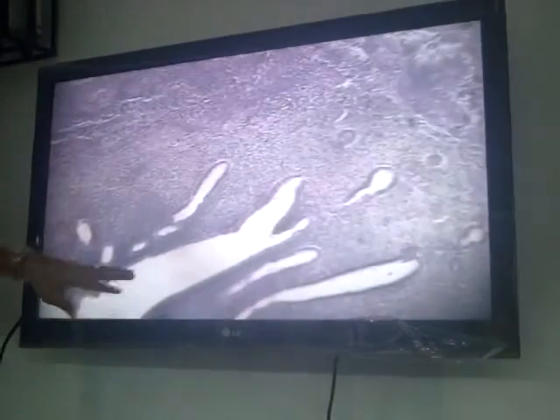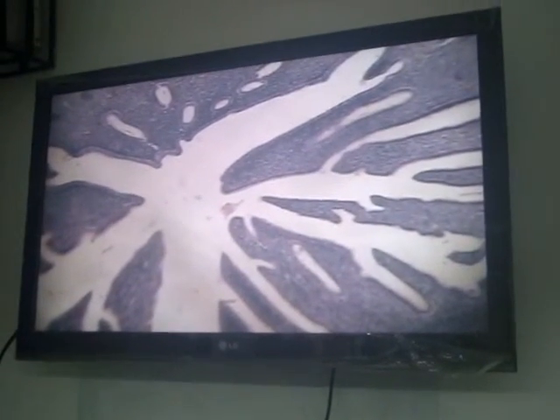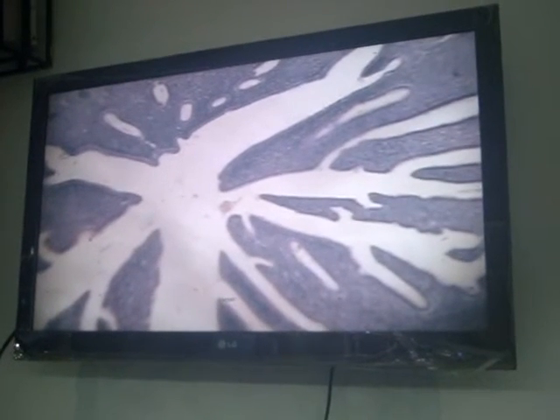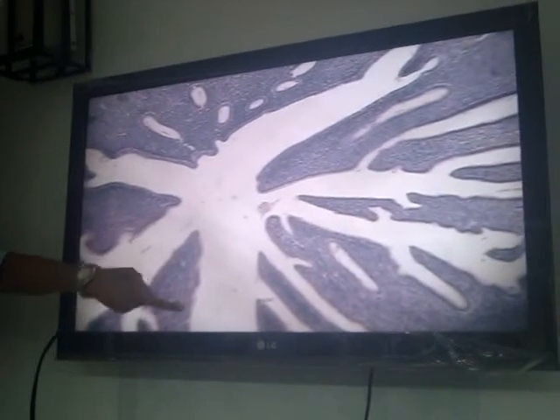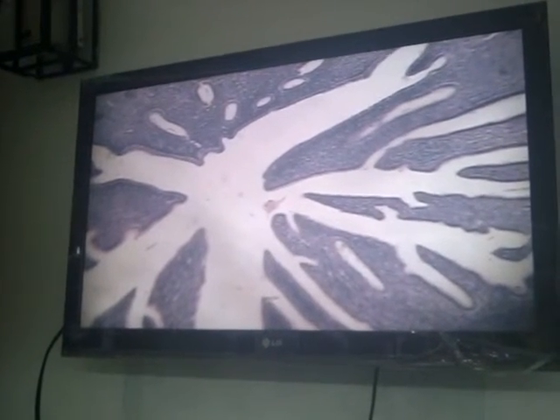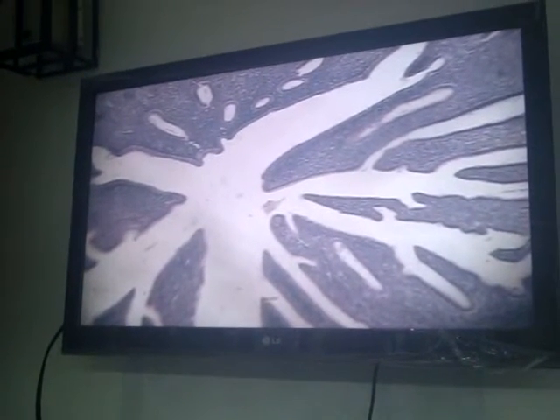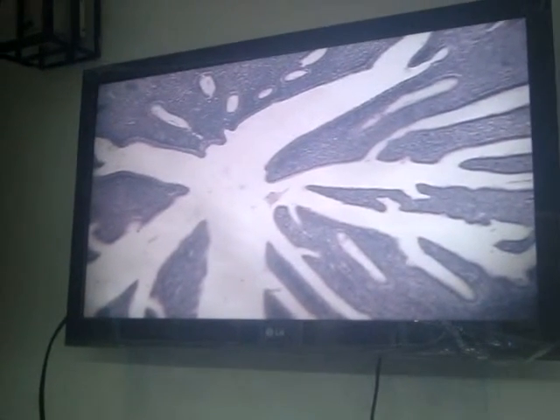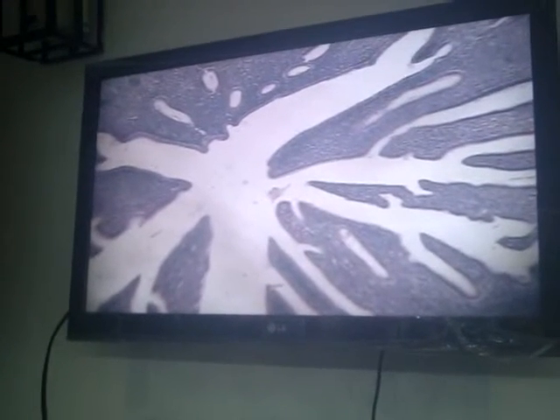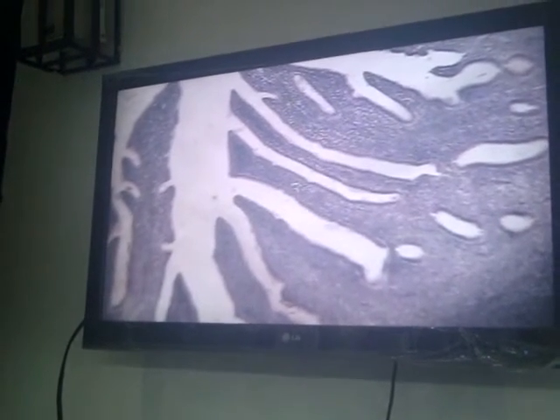Okay, class, you focus on the epithelium of the fallopian tube, class. This is lined by two types of cells. Simple columnar ciliated and simple columnar non-ciliated epithelium or peg cells. So that's an example of your simple columnar ciliated epithelium. We're going to pseudostratified. They have the slide with the trachea.